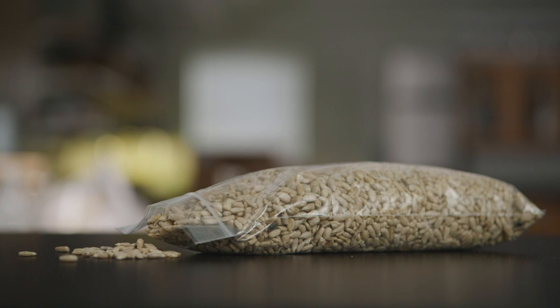In nature, milkweed bugs feed primarily on milkweed seeds, but these cultures have been bred to feed on raw, cracked sunflower seeds and will take several generations to adapt and thrive eating a different food.